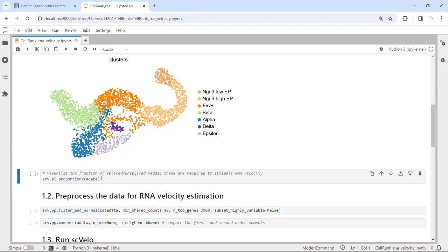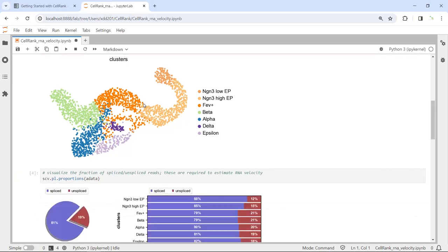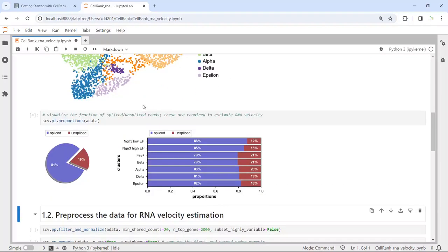We can look at the proportion of spliced and unspliced mRNA in this dataset. You can see we generated a figure — in total, 81% of mRNA is spliced and 19% is unspliced. Here are the proportions broken down in each cell cluster.